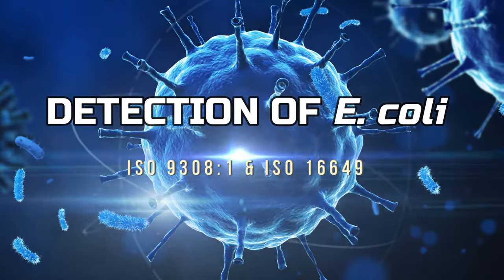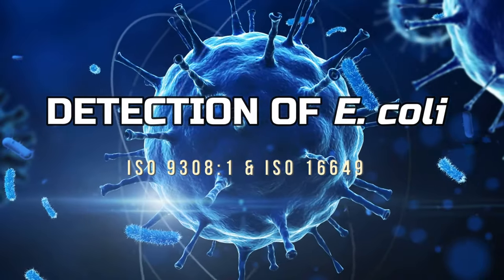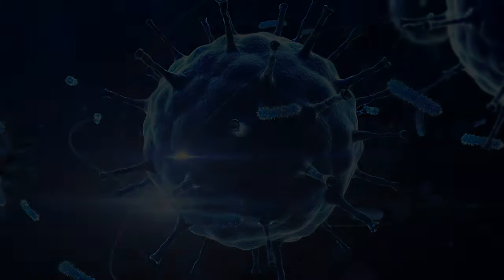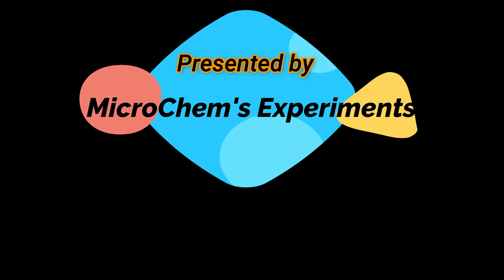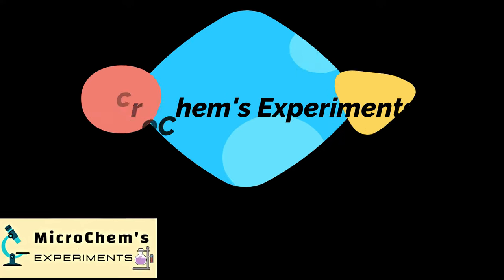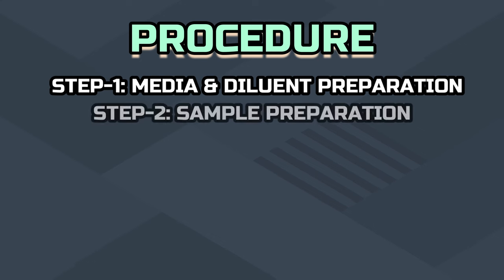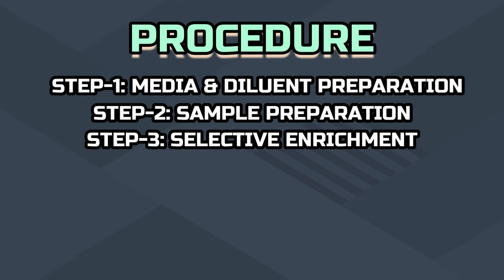Hello viewers, in this video we are going to represent a very important microbiological test, which is detection of E. coli. Welcome to Microchem's experiments. Be with us, be a laboratory expert. We can detect E. coli by following 7 steps shown in the display.